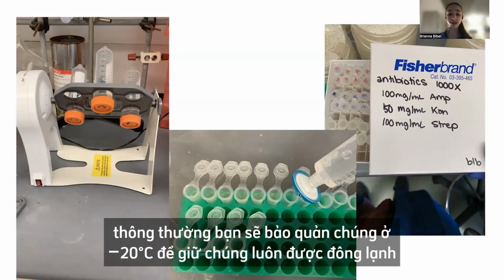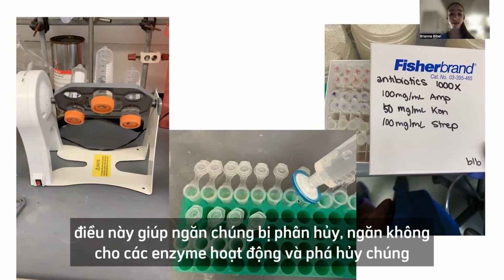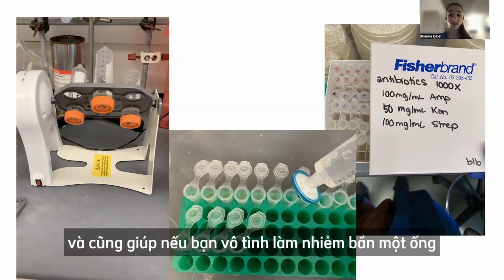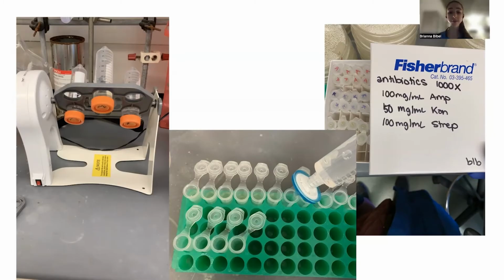You typically put these in the -20 to keep them nice and frozen, or in the case where it has ethanol, it's not actually going to freeze, but it's still kept really cold. This prevents their degradation and prevents any enzymes from being active and destroying them. It also means that if you accidentally contaminate one of the tubes, your other tubes are still okay.